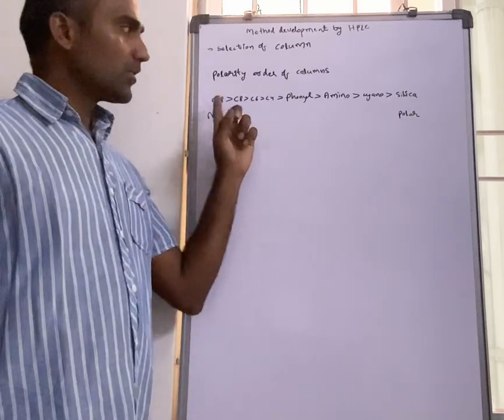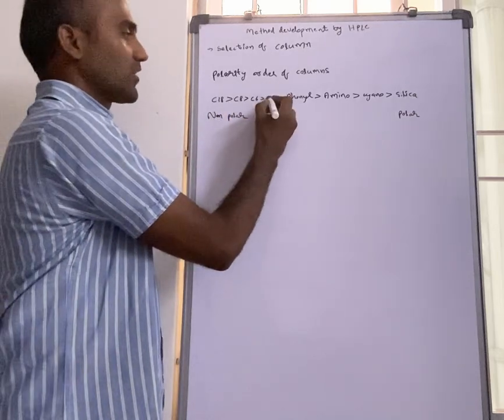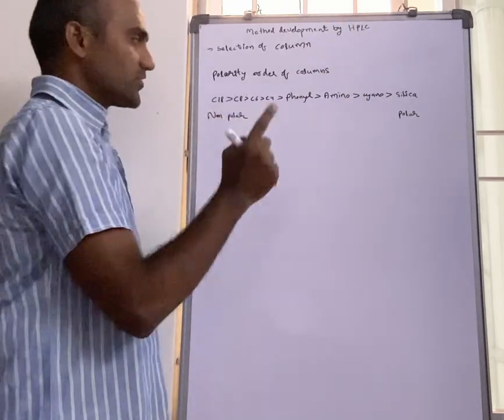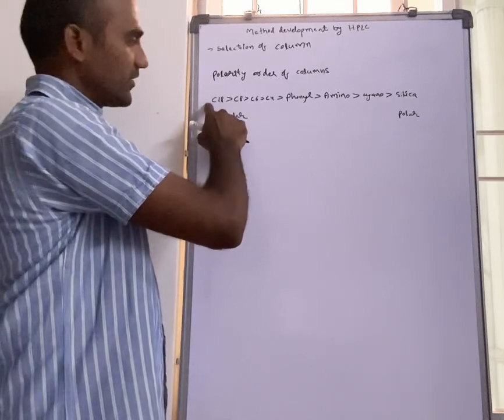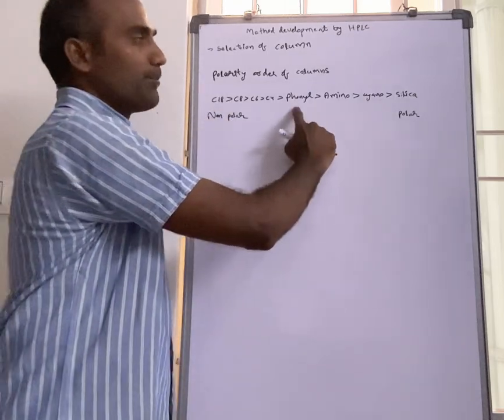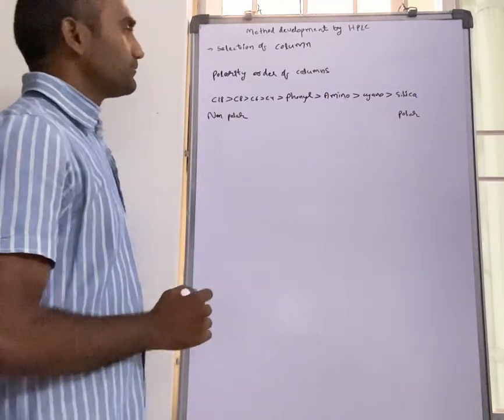This is more non-polar and this is more polar. So C18, C8, C6, C4, these are carbon chains. Phenyl, amino, cyano, silica. Okay. Remember shortcut. These are carbon chain lengths in increasing order. If more carbon load is there, then it is more non-polar. And here PACS, phenyl amino cyano silica. Remember that shortcut word. Okay.